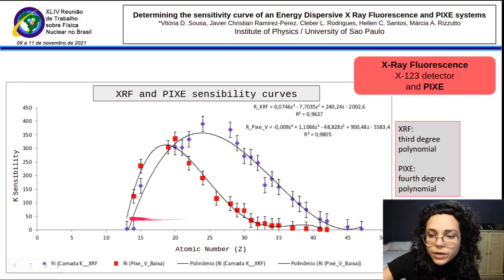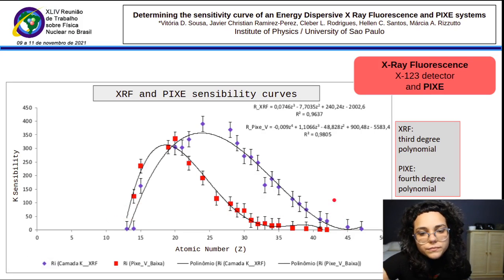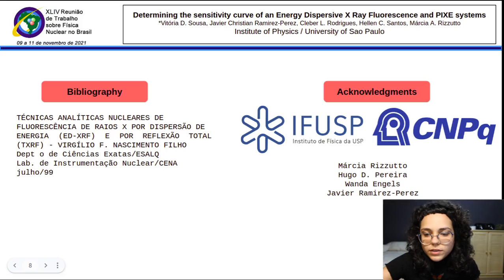Unfortunately, here in the region around z equal to 40, it also has small values, and we detect the spectral lines with less sensibility. So this is what I wanted to show to you guys.